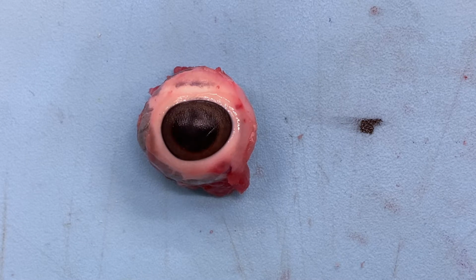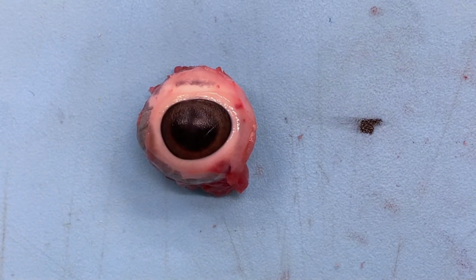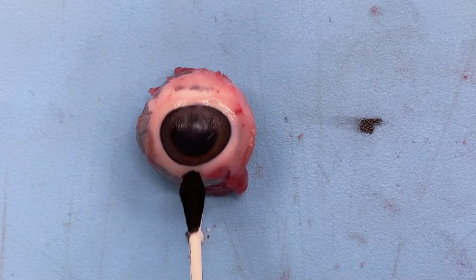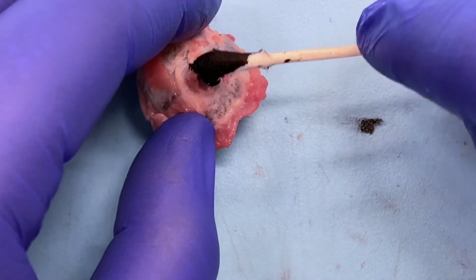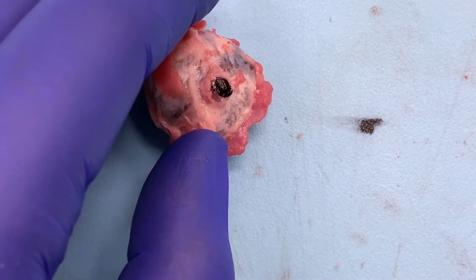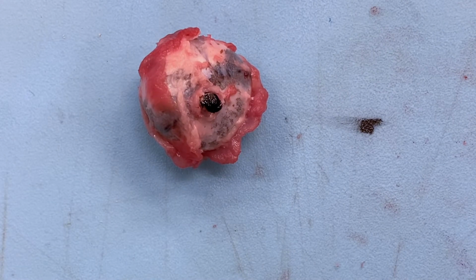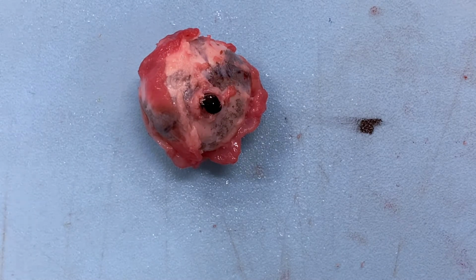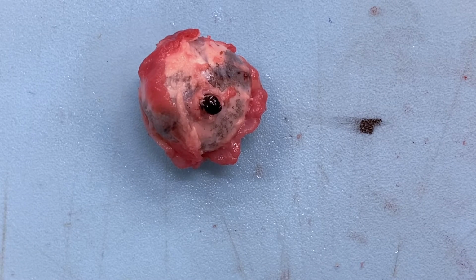So let's say hypothetically we've let this sit for 48 hours in fixation. We've already transilluminated it. And let's say I'm going to make a dot on here, that our tumor was in this general region. Okay. Now the first thing I want to do is ink the resection margin on my optic nerve. That is really the biggest margin we're worried about in this case, since everything else is covered and protected by sclera. It's not a true margin.